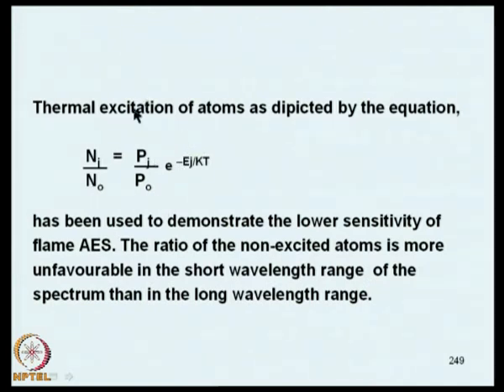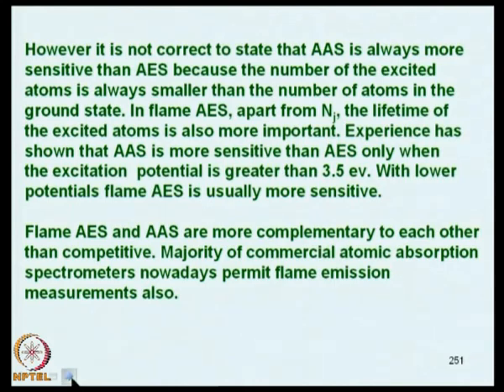That aspect is not taken care of in this equation. The lifetime term does not appear, so apart from Nj, the lifetime of the excited atoms is also important.